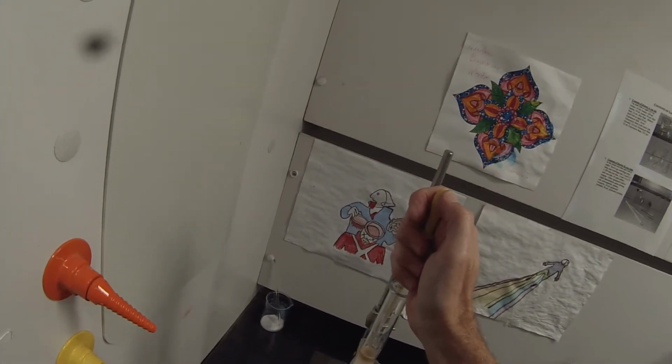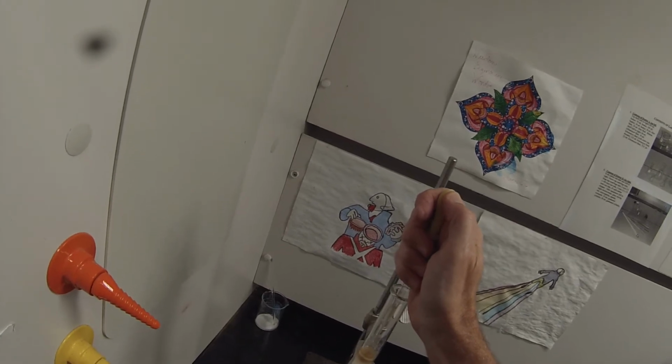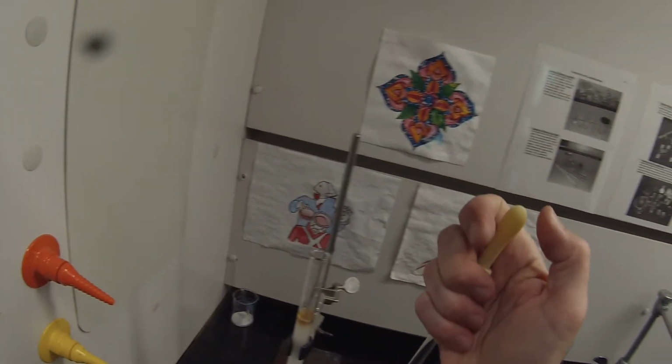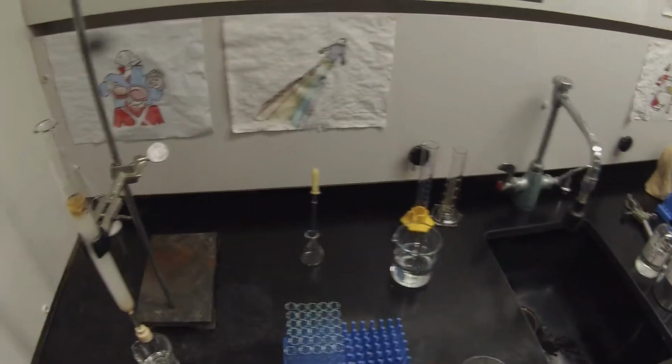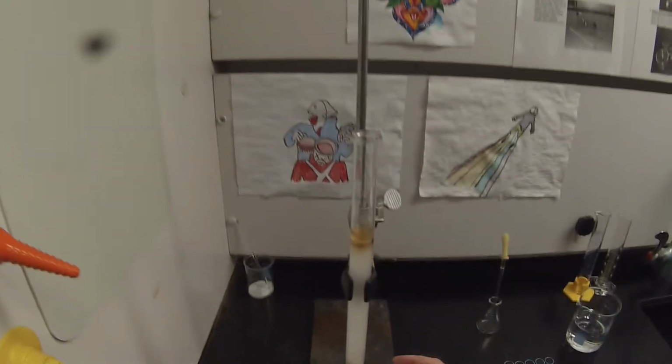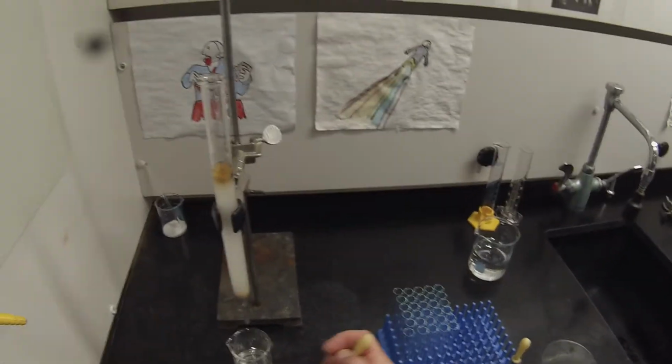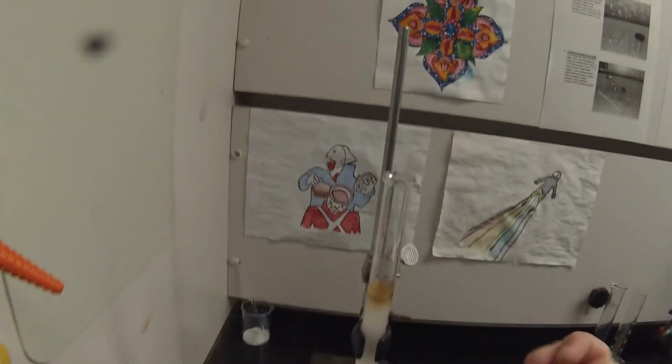Alright, so that's completely dissolved now. That will enable me to add that to the top of the column. And it's a little bit more of a layer than I'd really like, but given our lack of choice, that's what we're doing. And we don't need those anymore. So now I also need to let that drip. And I want to make sure that it actually goes into the column.